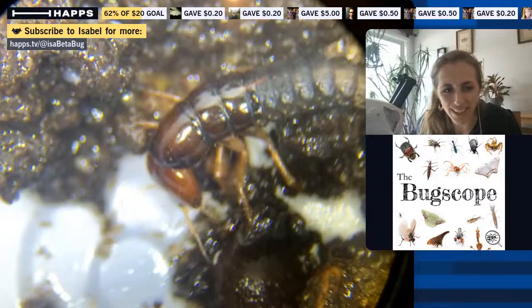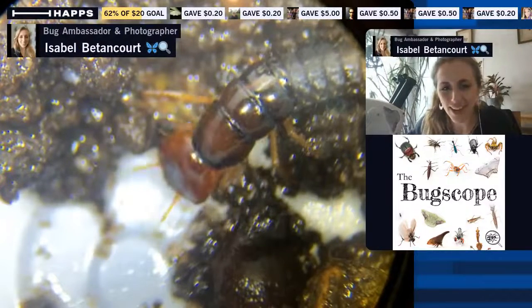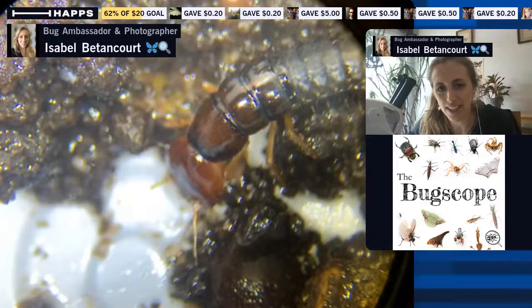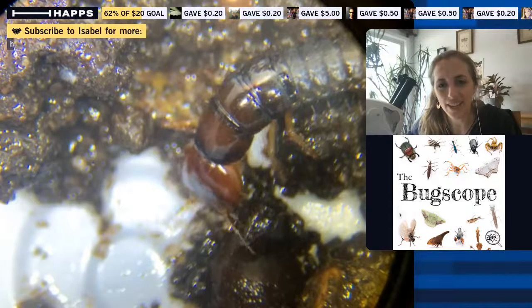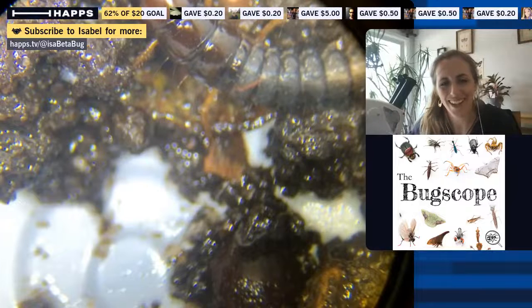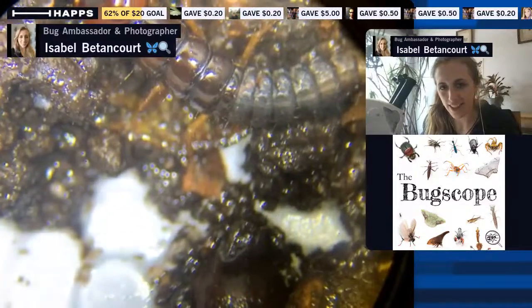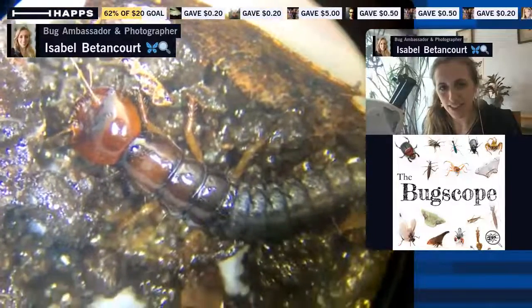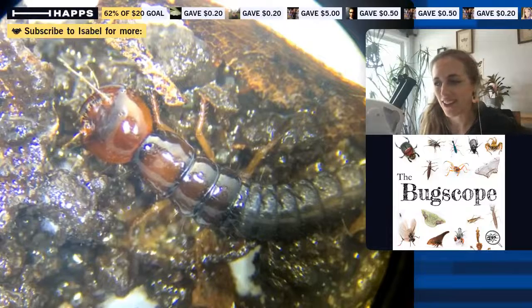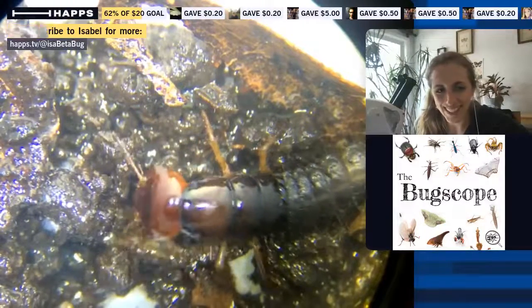I'll adjust the focus for us. Hi Kevin, hi Jay. So here's our little insect friend — go ahead and put your guesses as to what insect group this is. Insect orders include butterflies and moths — Lepidoptera — beetles, Neuroptera which are lace and net-winged insects, Odonata like Linda said — dragonflies — and Diptera, which are flies. This is a larval form, and David did guess it: it's a larval beetle of some kind.